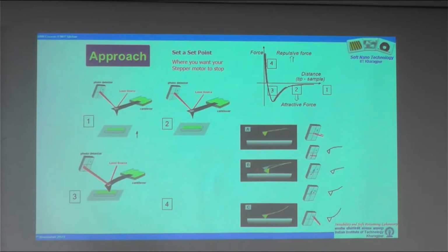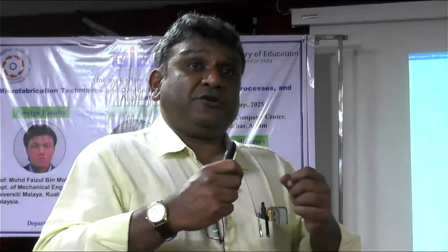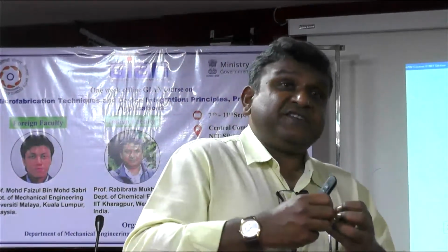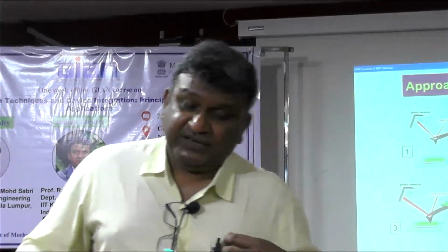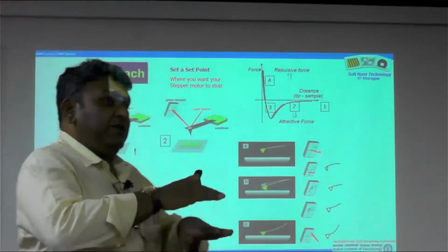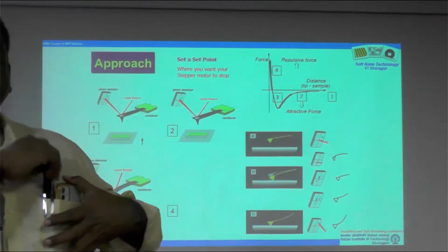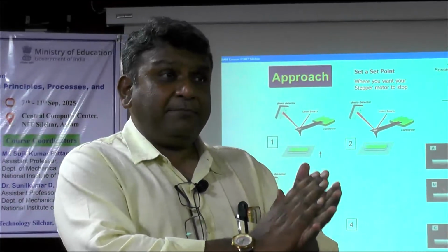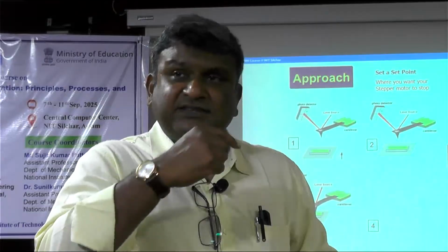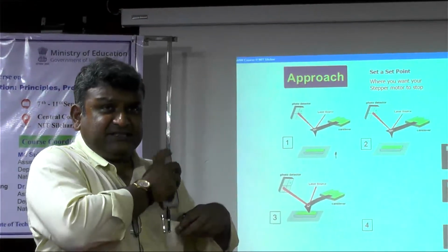You now have to recall the concept of van der Waals interaction. When two atoms or molecules come close to each other, there is an interaction. Similarly, when two surfaces come close to each other, there is also this van der Waals interaction. In fact, if you are also there in the afternoon lecture, I will show some nice videos on this. So when do these surfaces come close to each other? Every time you clap, every time you put your hand somewhere, every time you put an object on another thing, this is happening. Now these are rigid objects, so there is no visible signature of these interactions.